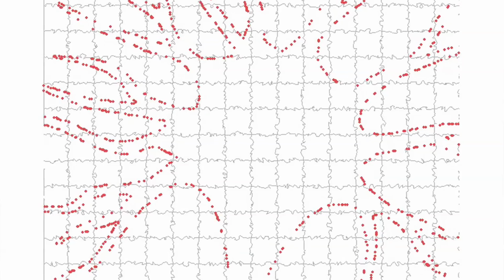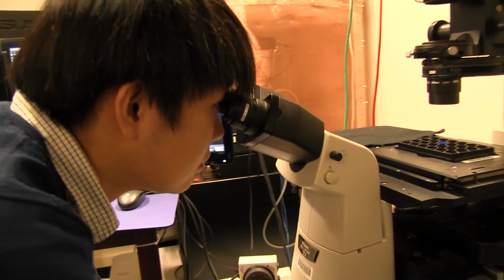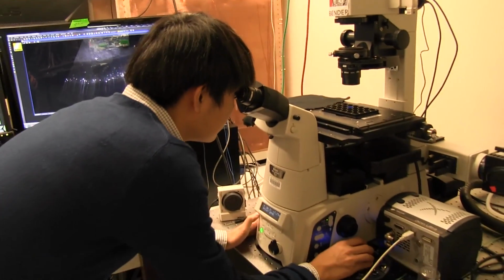With this technology, the polymer network extends 4 to 5 times in all 3 dimensions evenly. So the relative shape of the structures you want to look at stays the same, it's just bigger. This is important because this means anyone out in the world can apply those steps to their sample and put it on the microscopes that they already own to make their microscopes into super resolution microscopes.